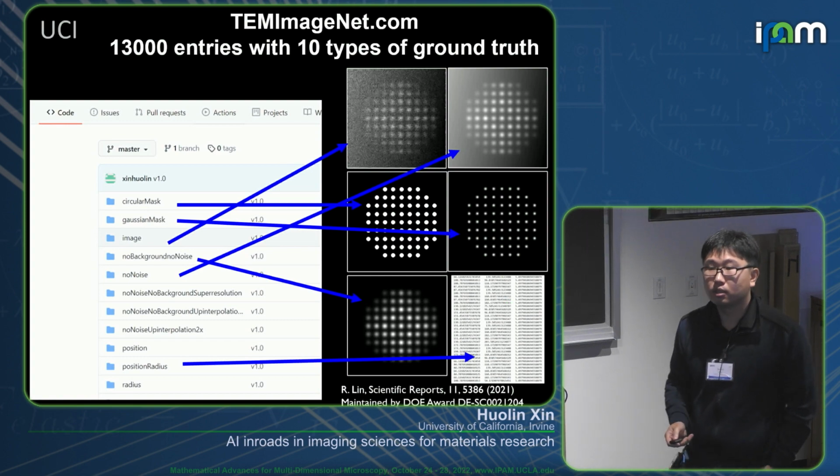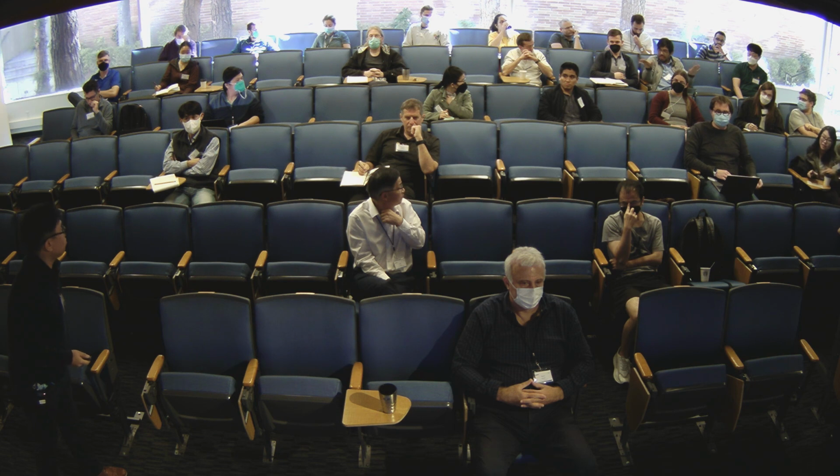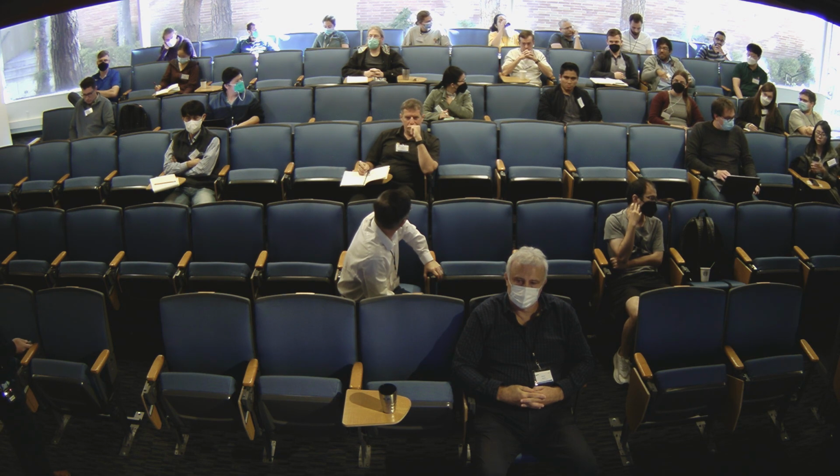Quick question. So you were saying that you care about atomic positions of the atoms, right? Yeah. That's what you care about. That's what I care about, period. Apparent position. Then you don't even need to do simulations. You just use something like Vesta, even worse than scattering potentials.